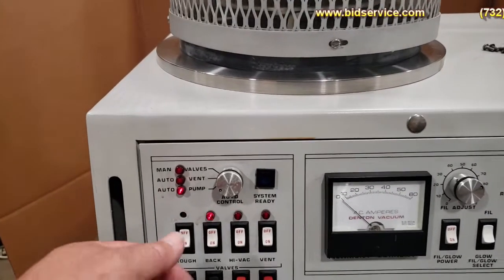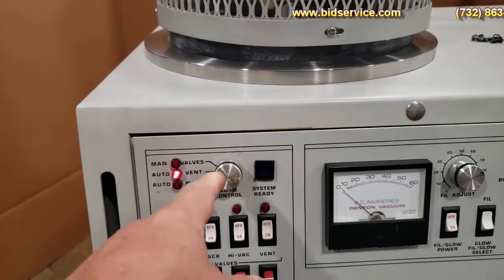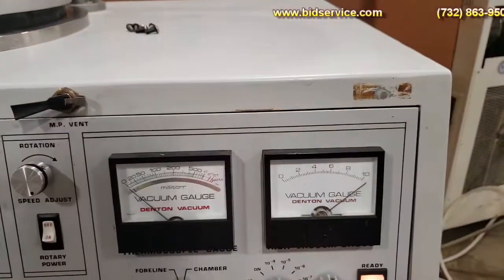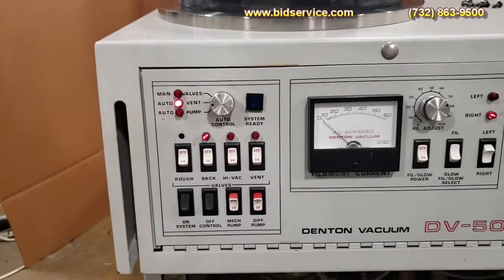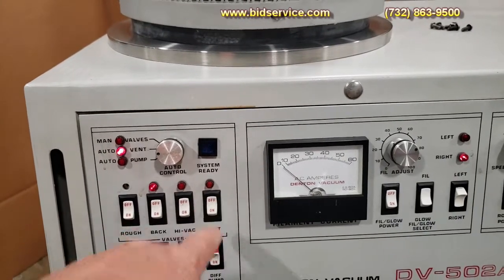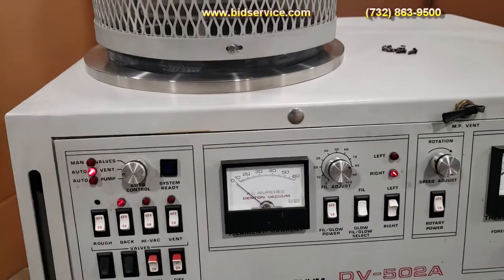So right now, to vent the system and get to the chamber, we're going to put this on vent. We're going to shut off the HiVac valve - the HiVac gauge - old cold cathode gauge. And right now you can see that the vacuum is still on. This vent light should be on right now, and as you can hear, it is venting the chamber.